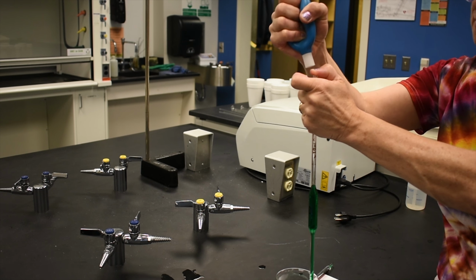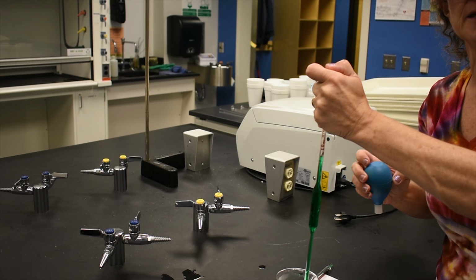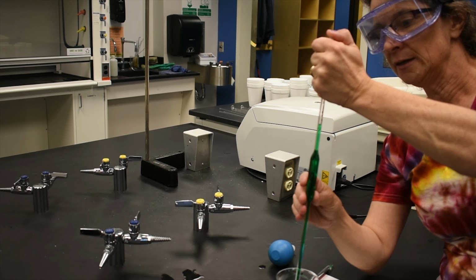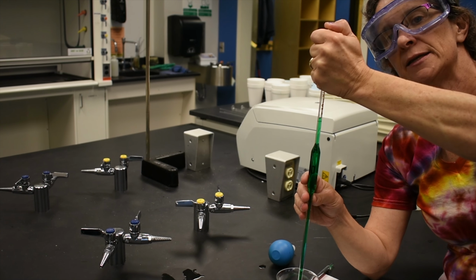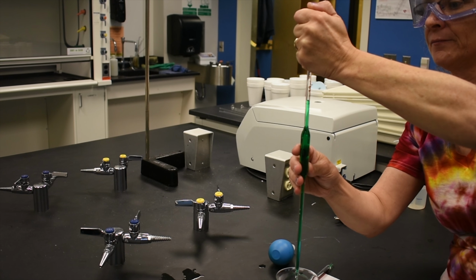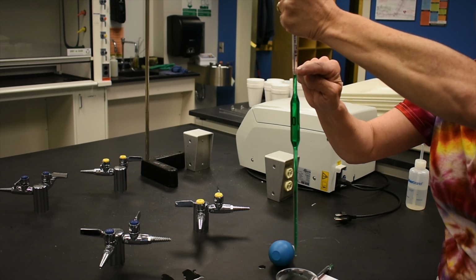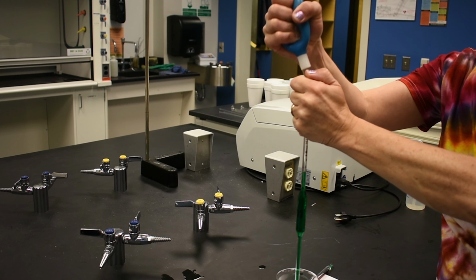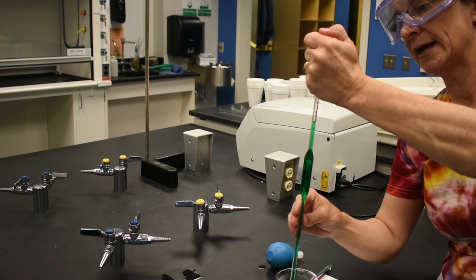I'm going to draw some up so I'm a little bit above the line, but not so far up that I'll end up with solution in my pipette bulb. Now, the tricky part is trying to release your thumb so that you end up with a meniscus exactly at the measurement line. And when I did it the first time, you can see the line is right here and I let too much out. So what I need to do is squeeze the bulb out again, pull up so it's past the line, and try again.